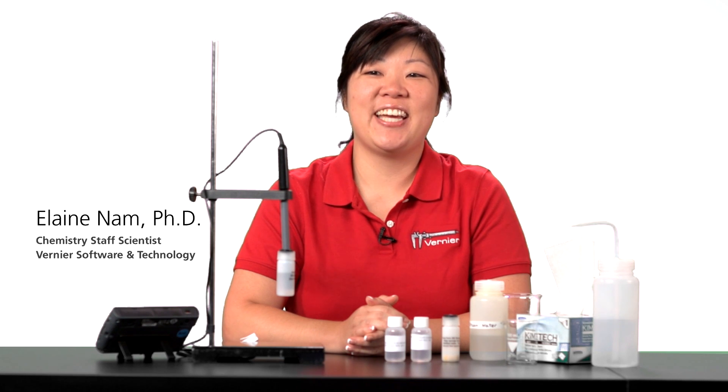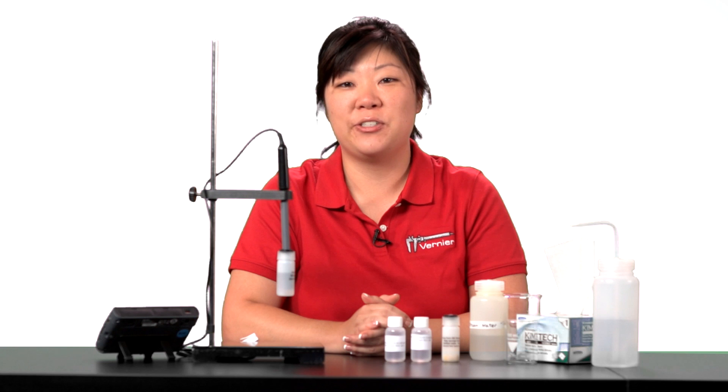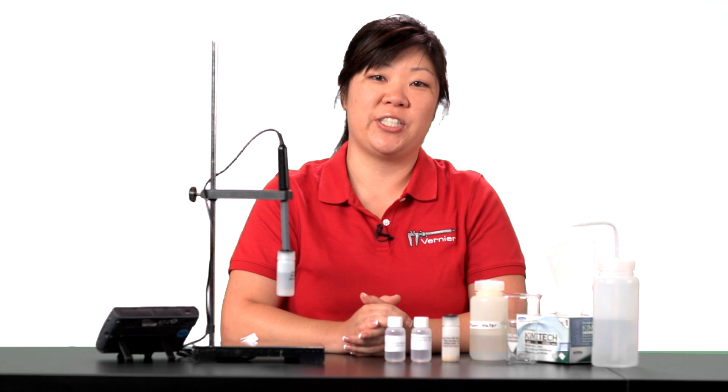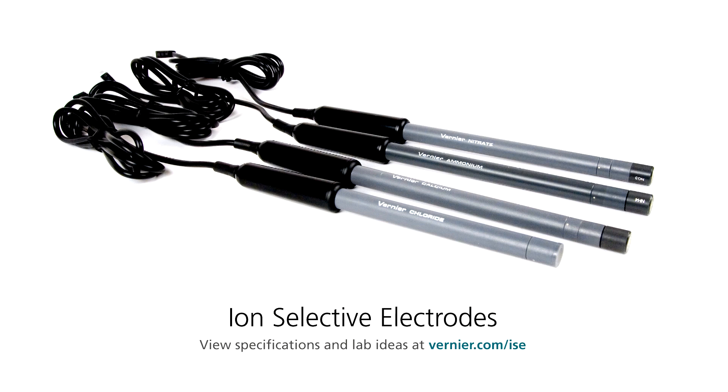Hello. I'm here today to introduce how to use ion-selective electrodes. Vernier ion-selective electrodes can be used to measure the concentration of specific ions in aqueous solutions. Vernier offers four different types of electrodes: nitrate, ammonium, calcium, and chloride.